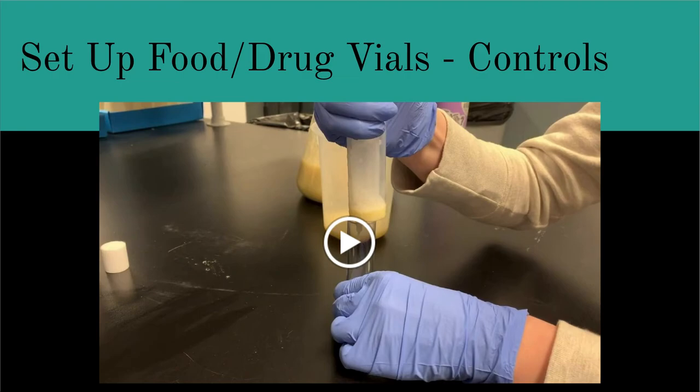We have a couple of different options for this coming week. One thing that you could do is a 1 to 10 dilution series just to try to capture when the effect drops off. And of course, all of this is assuming that your compound works. We'll talk about what happens if your compound doesn't work next week. But for now, let's just keep plugging away based on the assumption that this compound is going to work.